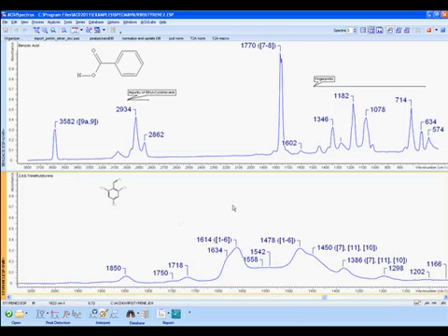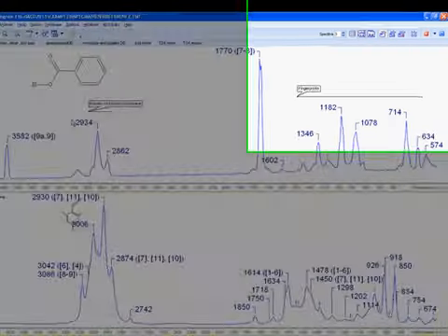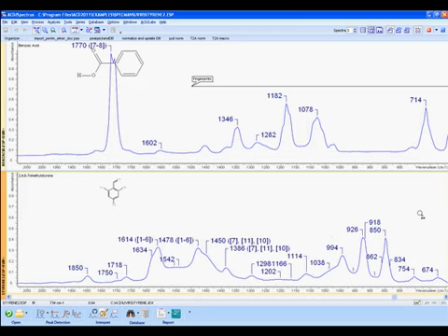If we are looking to simultaneously operate on both spectra, we must designate them as related. To do this, we perform a shift click on the second window and click on the Synchronize button. This will synchronize the x-axes, letting the software know that they are related. Executing a right-click horizontal zoom will now change the views equally. Clicking on either spectrum will produce a vertical line, which is useful for seeing how well peaks align.